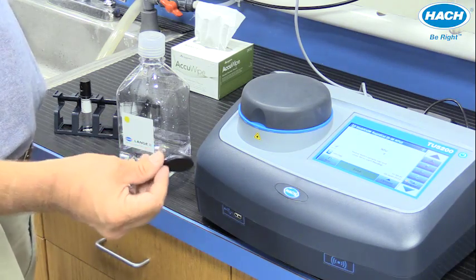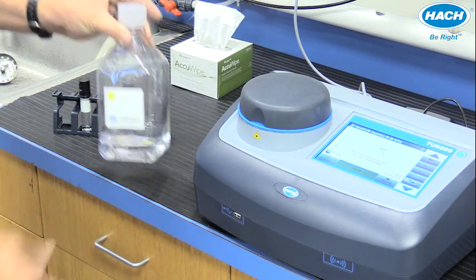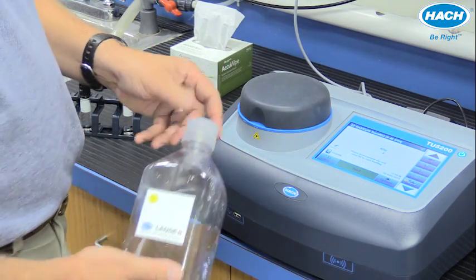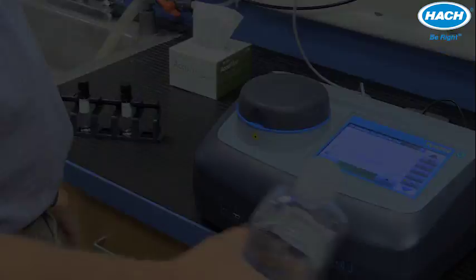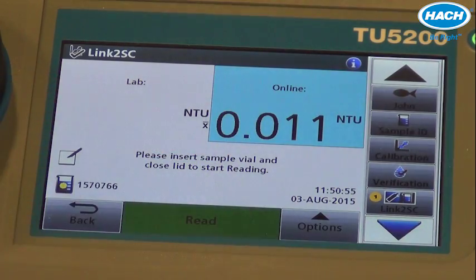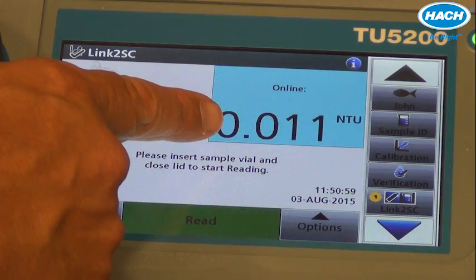We'll log in to the TU5200 with our operator tag and simply swipe the sample bottle by the RFID reader on the TU5200 to load the information from the process instrument. The .011 NTU is the value that came from the TU5300.